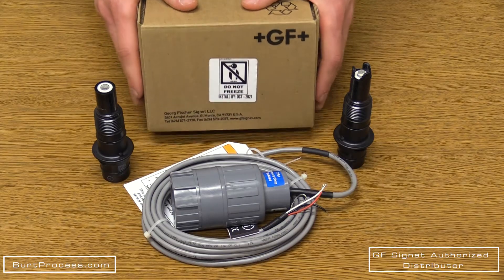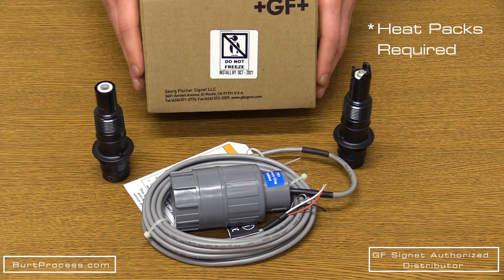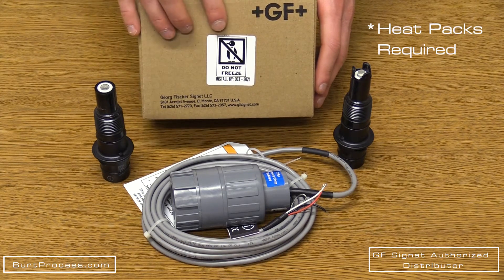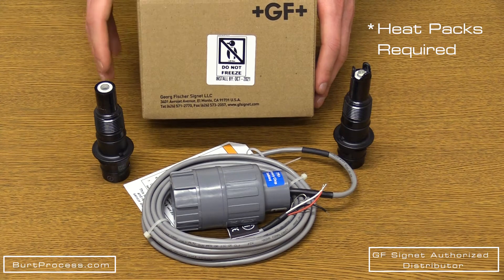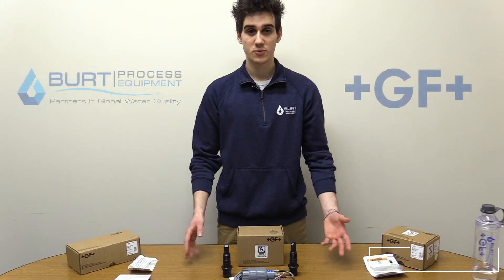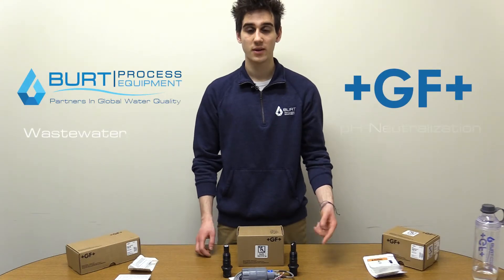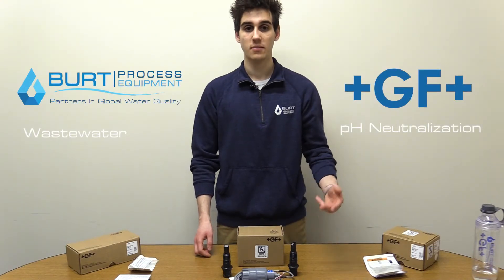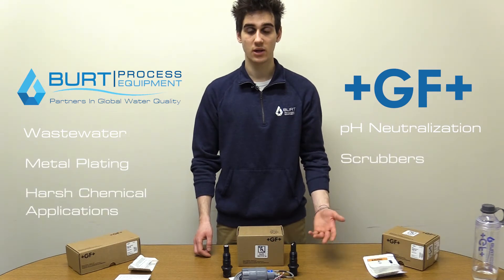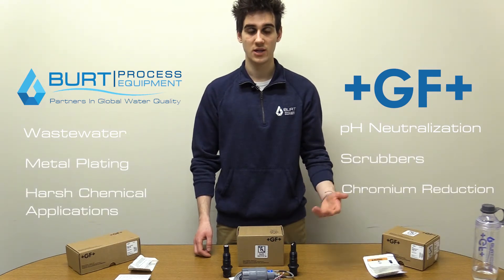To avoid damage from cold weather freezing, this product needs to arrive at its destination within one or two days of shipping. Heat packs are required in extreme cold temperatures to prevent damage to the electrodes. These products have applications in wastewater pH neutralization, metal plating, scrubbers, harsh chemical applications including chromium reduction, and many others.